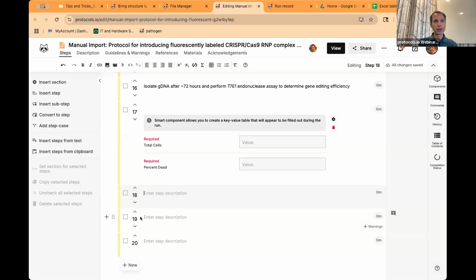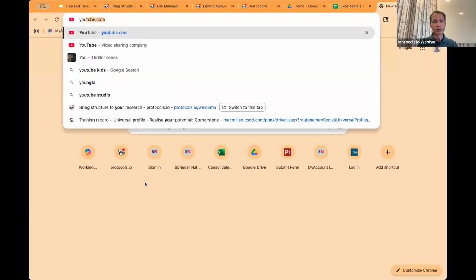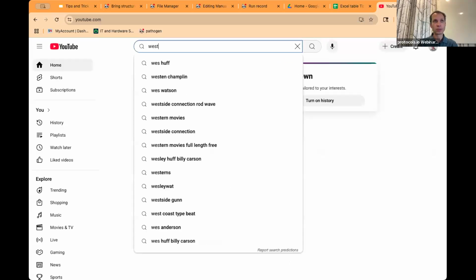But one thing that I want to point out in this webinar is if you have a video from YouTube, Vimeo, or another platform, you can embed it in the protocol.